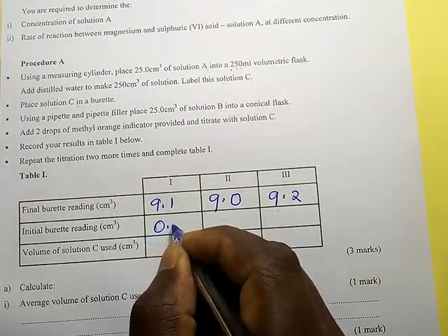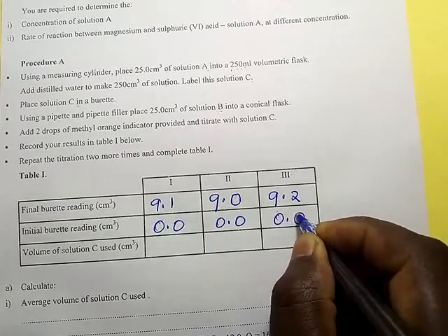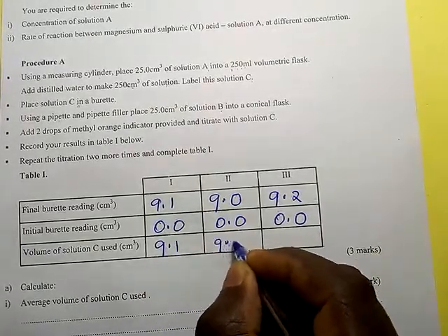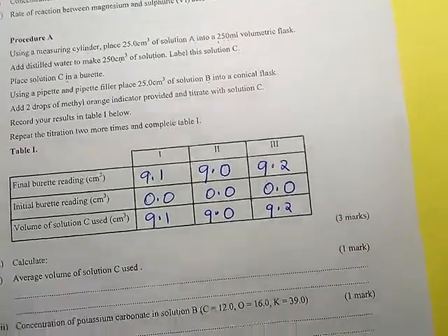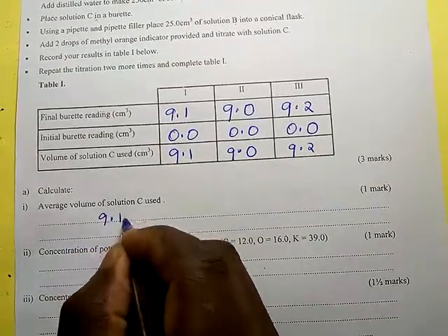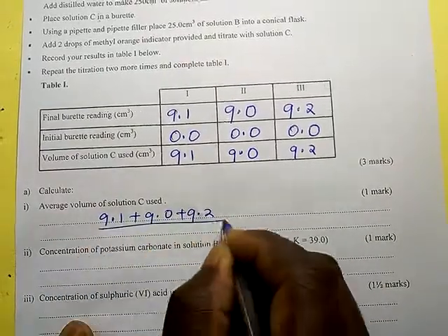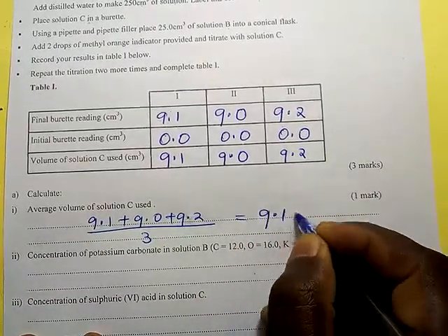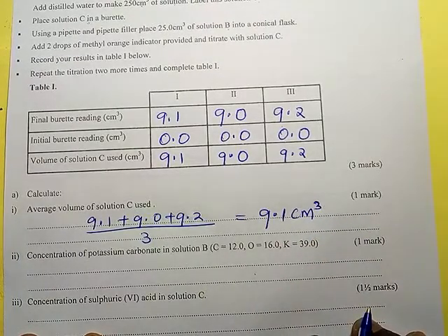9.1, 9.0, 9.2. The initial, let us take 0.0, 0.0. Our titre values here are 9.1, 9.0, and 9.2. Let us do the average. Average is 9.1 plus 9.0 plus 9.2, divided by 3. This is going to give us 9.1 centimeters cube.